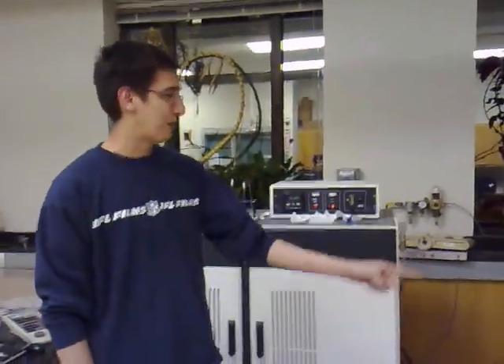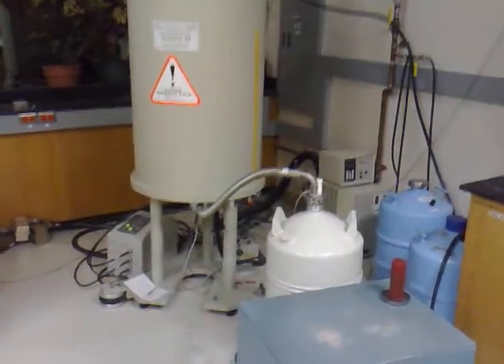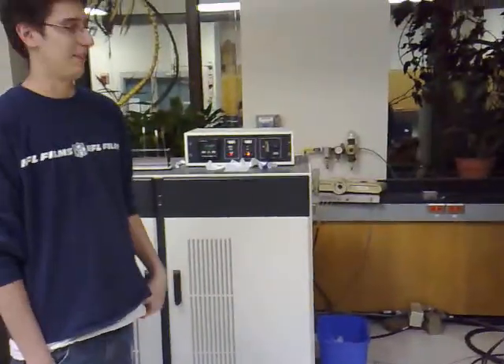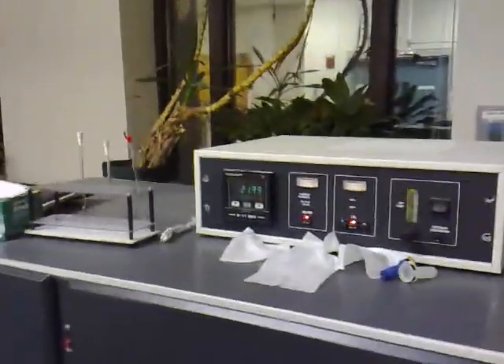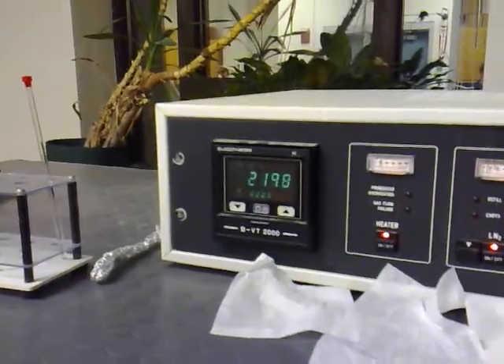Right now we're doing low temperature NMR studies. This is liquid nitrogen hooked up to the probe, so we're cooling it down to 220 Kelvin, which is about minus 50 degrees Celsius. We can take NMR spectra at various temperatures. Yeah, that's cold.